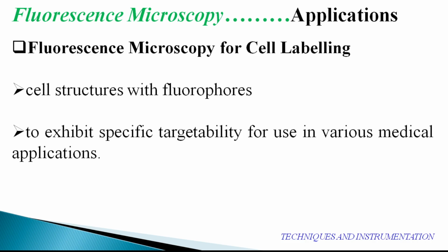So tracking and analyzing the viral DNA present in a cell, and connecting this observation to cellular antiviral defense research, is possible nowadays due to this mechanism of fluorescence microscopy, where we can do cell labeling. So this has very good potential, the ability to carry out different types of experiments or research at the cellular level. So dear students, this has potentially tremendous implications for future viral analysis and categorization also.